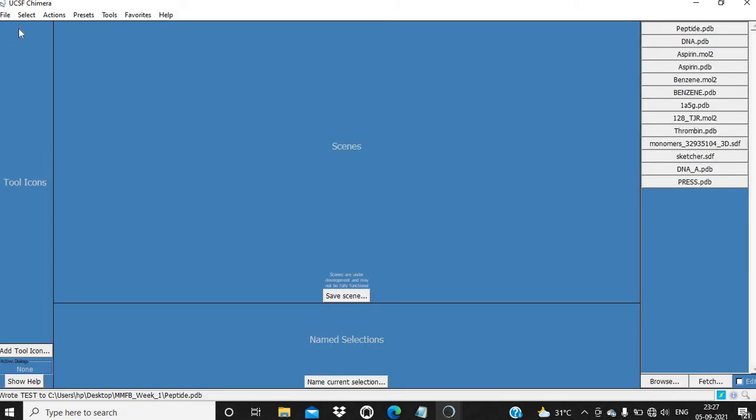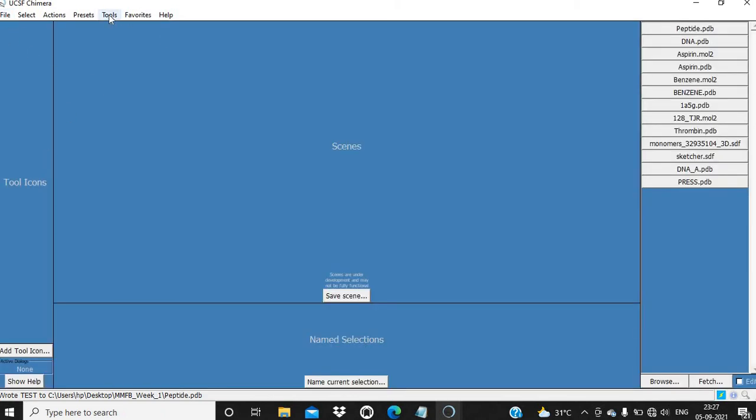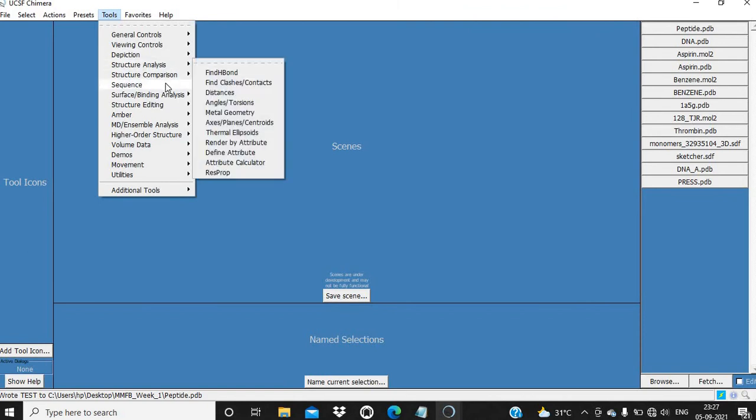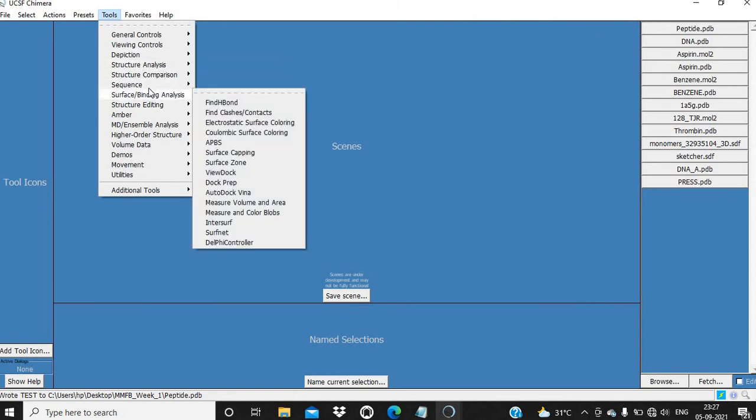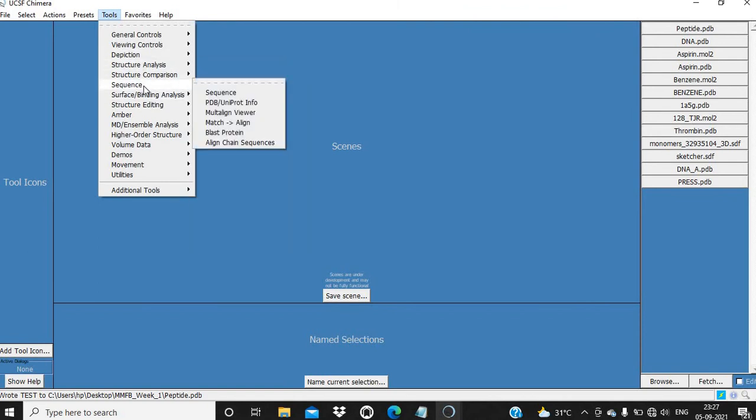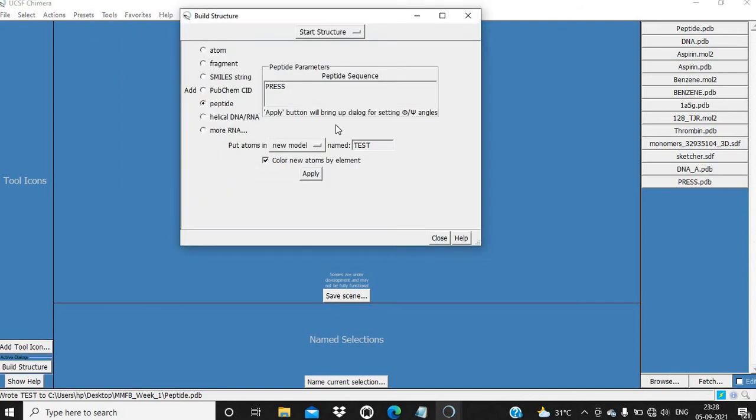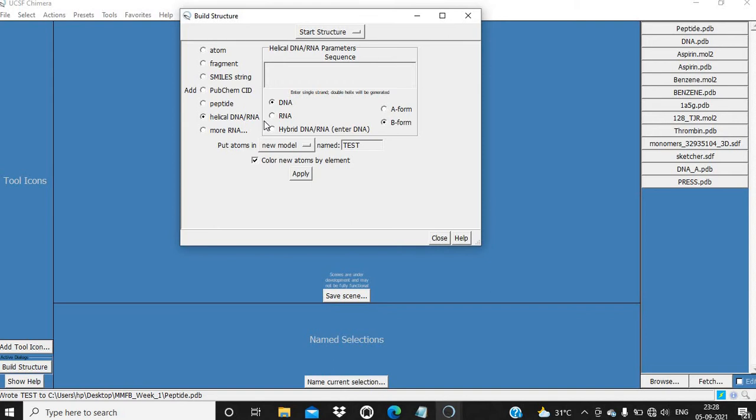Now I have closed this session and I am going to build the nucleic acid structure. For this, we have to click on Structure Editing, then Build Structure. Then select this Helical DNA RNA option and we are going to build DNA.